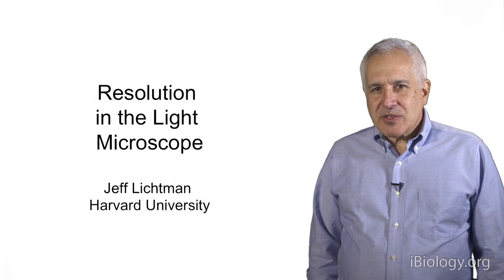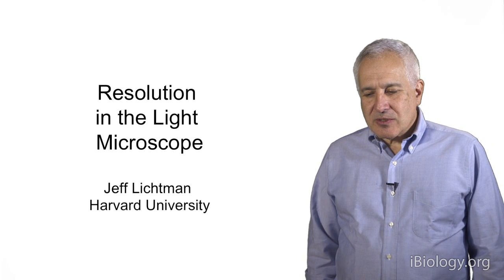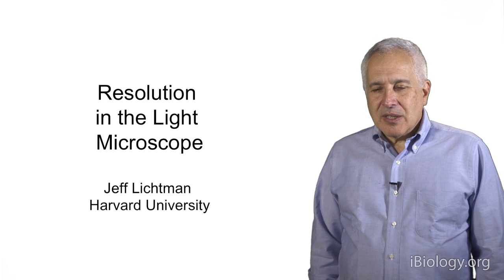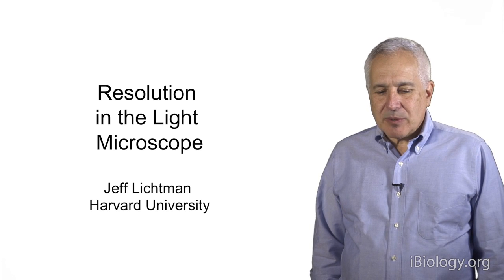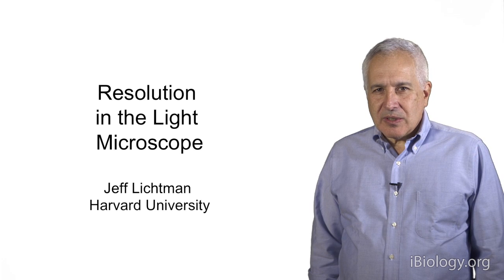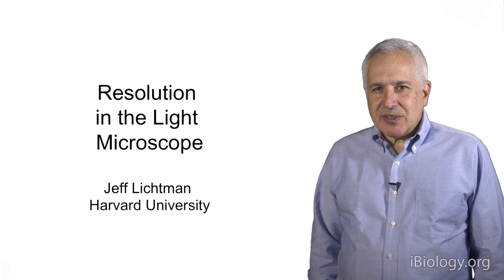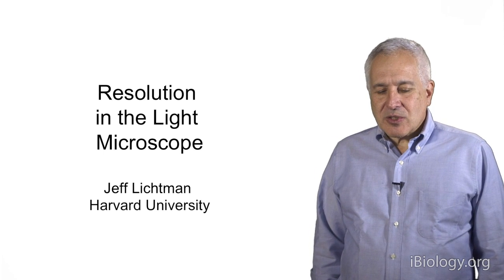My goal in this discussion is to leverage the insights you have in diffraction and the point spread function to understand how to practically take advantage of this as one does optical imaging. So resolution, of course, is the question of how much one can resolve detail in an image. And it relates basically to the grain of the image. We've talked about this in previous discussions.